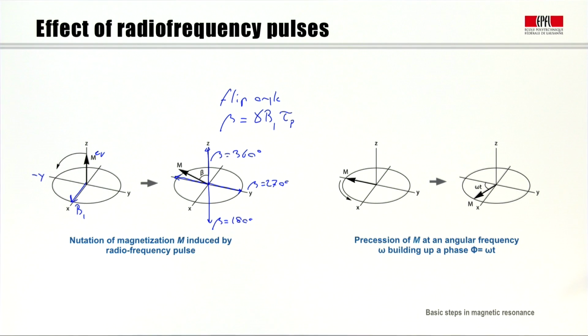Some people have worried about what happens with the radio frequency energy that you have put into the system. Well, it must somehow go in at one point and come out at some later point.